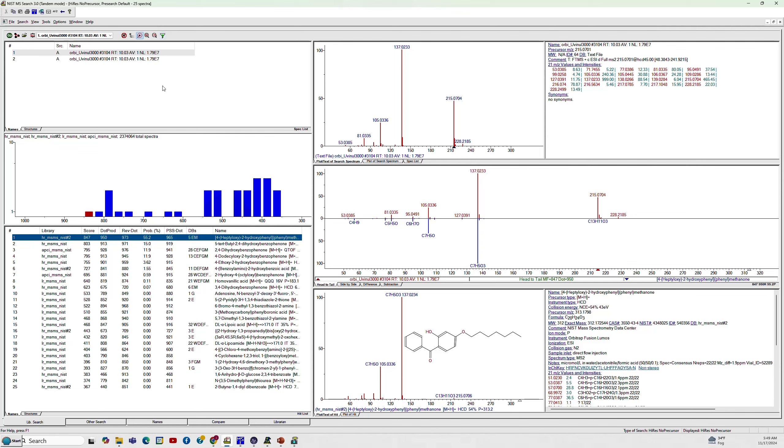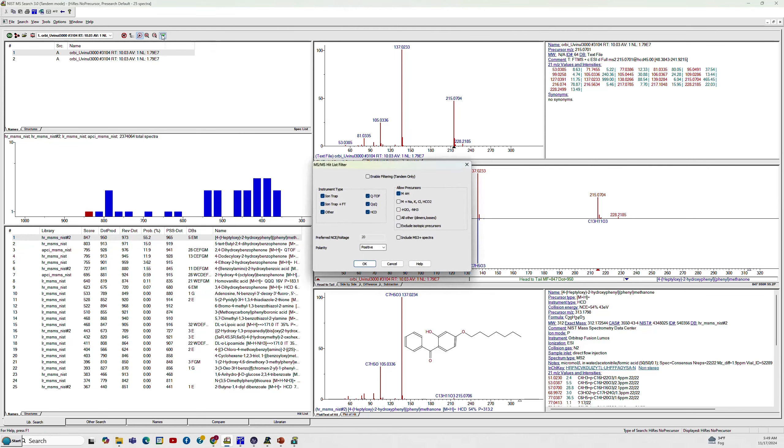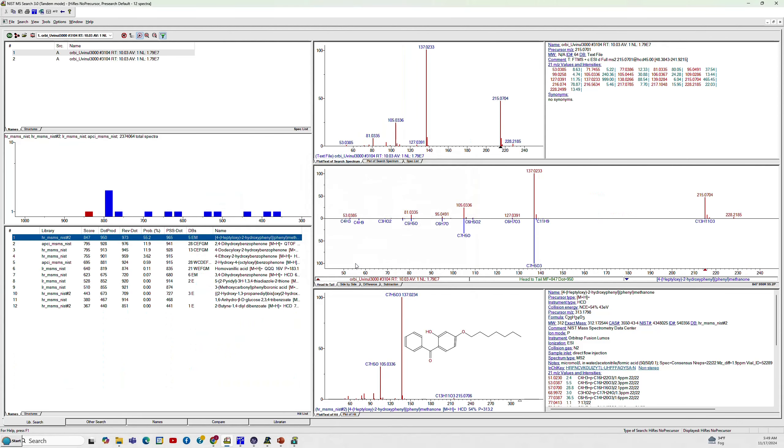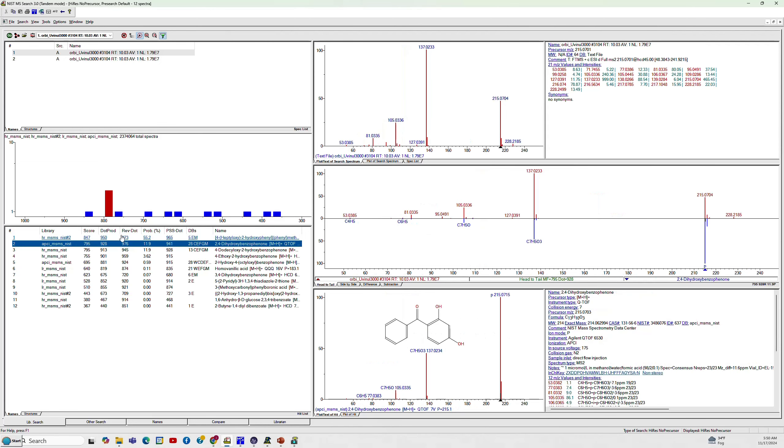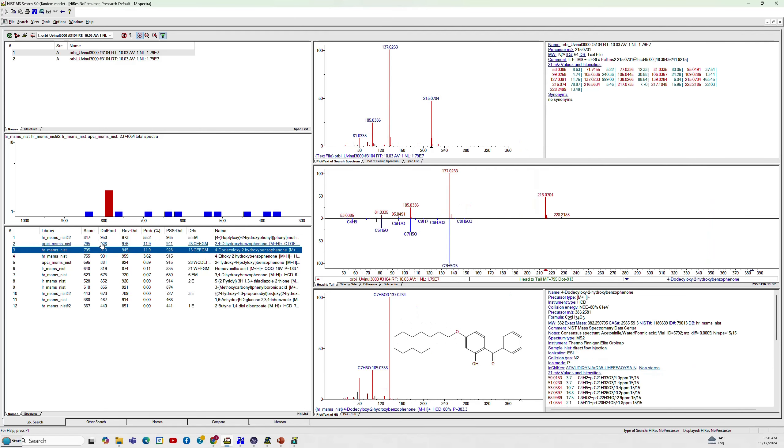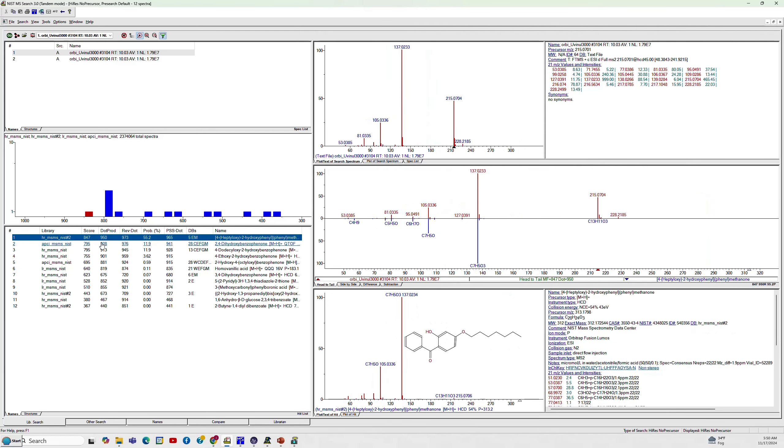So we have that. We can also go up to the filter up here and filter the list that we have. Not do another search. Just filter the list we have. We're going to say enable filtering. It is positive ion. It is M plus H. We'll just say okay. But we're not going to include the MS3 plus spectra if they happen to show up and say okay. So let's go look at our results now. This isn't an MS3 because this is from a precursor of 313, so it didn't get rid of it. And so we have that. And then second one down is what we want because we know it weighs 214, so an M plus H at 215 that has the right molecular formula.